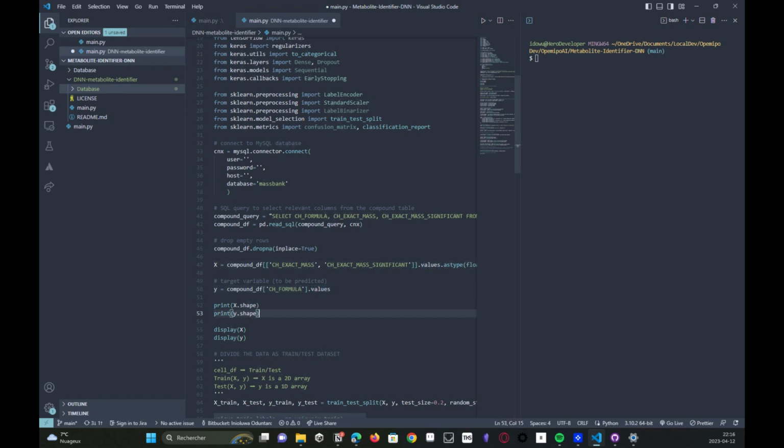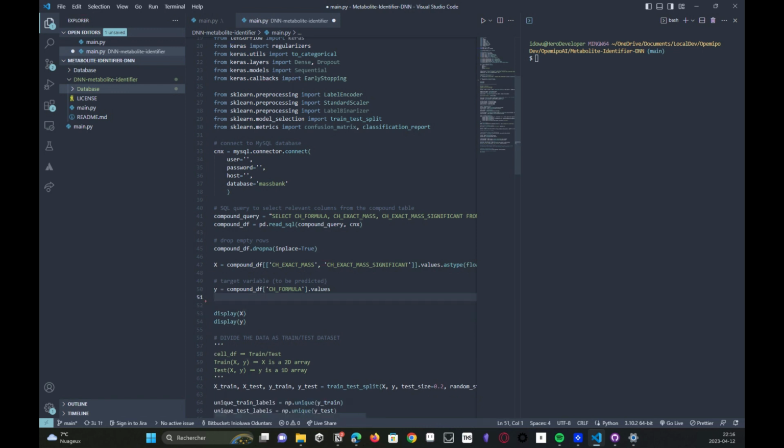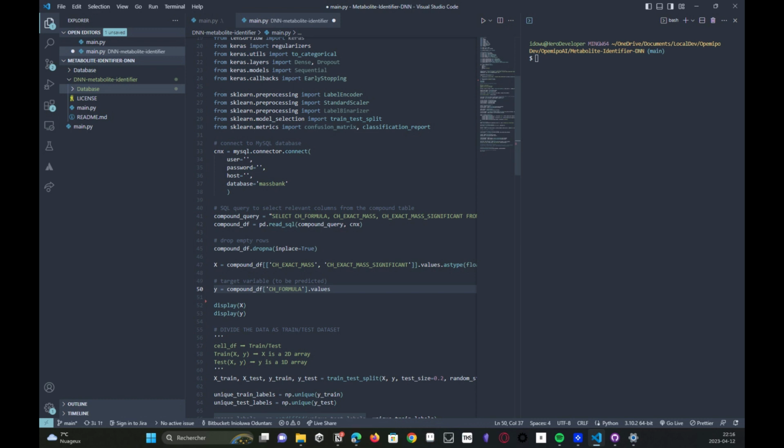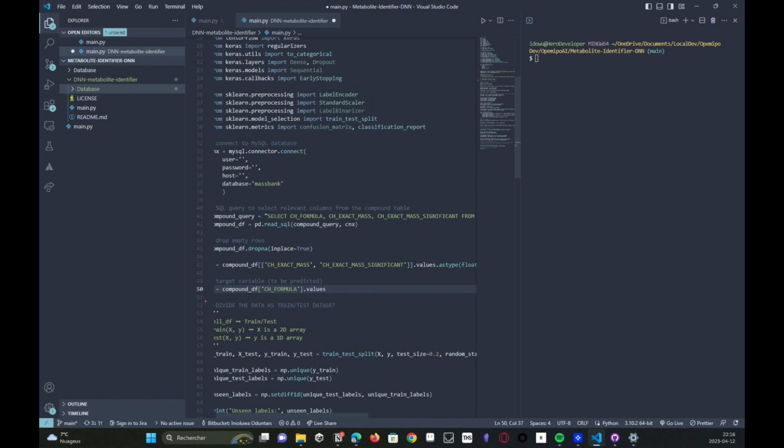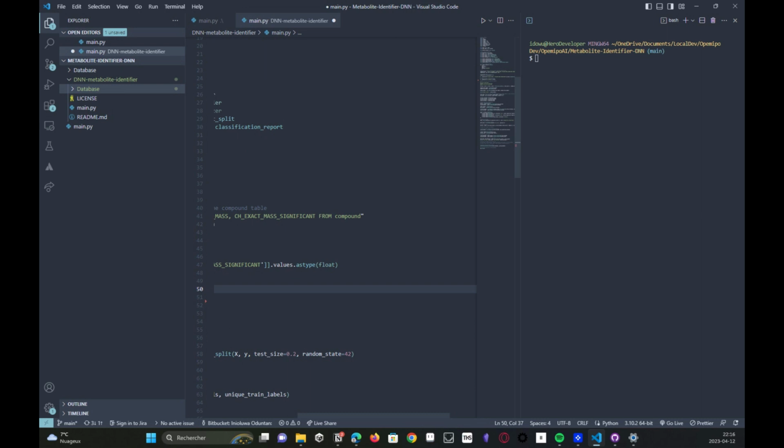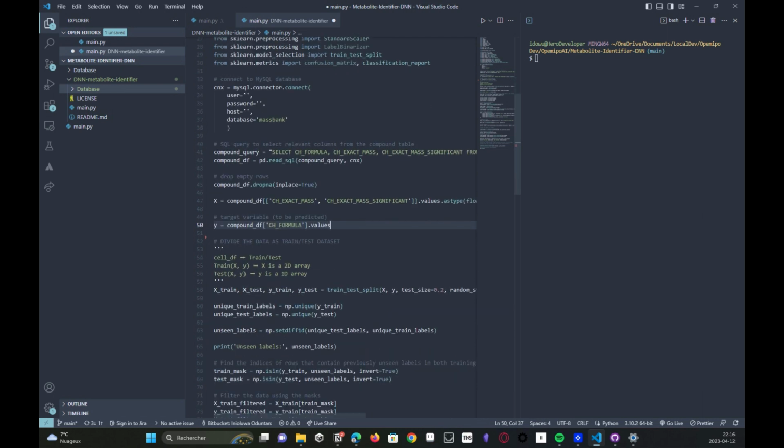Now, here's just some initial verification. It's just to make sure that there isn't any misalignment within the shapes. And from there, we just display the different data sets. This isn't necessary either. So from there, we actually divide the data into training and testing data sets. So this is really important for the model to be able to assess itself as well as use this data for training. So it's kind of making sure that you can achieve both with a single set of data.